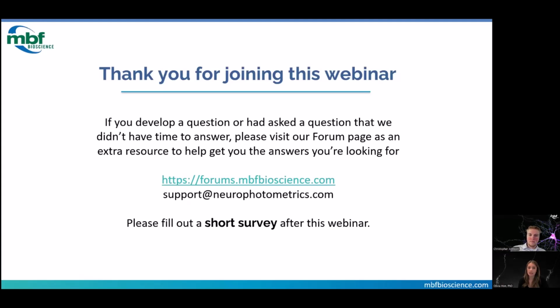Yeah, this is something that's really important to consider. It's a really good question. So if you have a really wide peak and your window is smaller than the width of your peak, then you can get some really funky signals. So that's where the calibration is really important, to make sure that you're setting your window size appropriately so that you're not cutting your peaks in half because your window is too short.